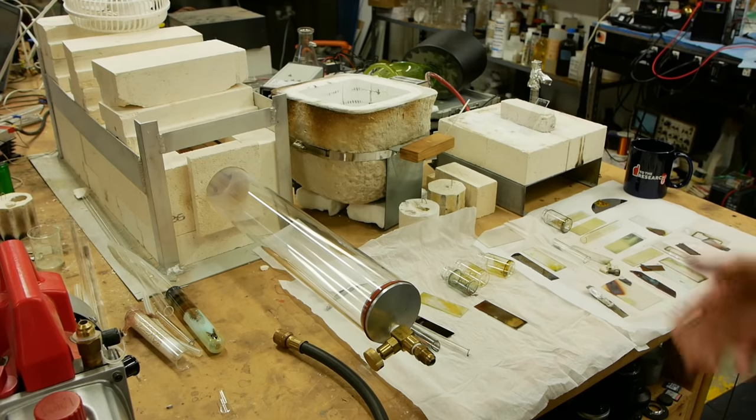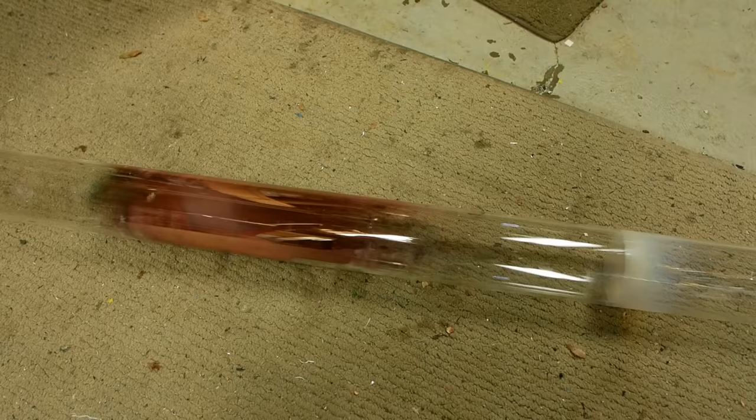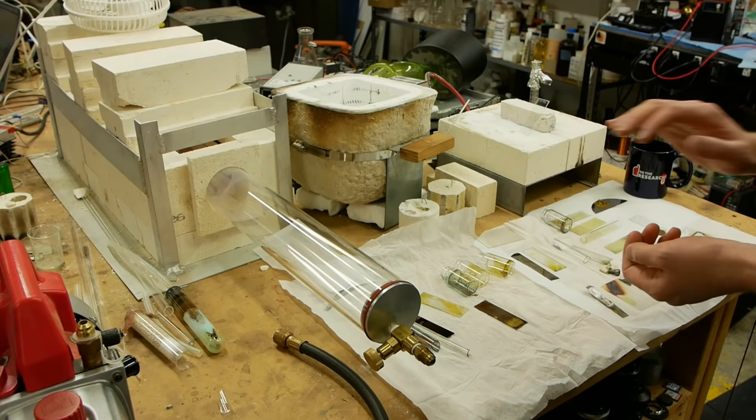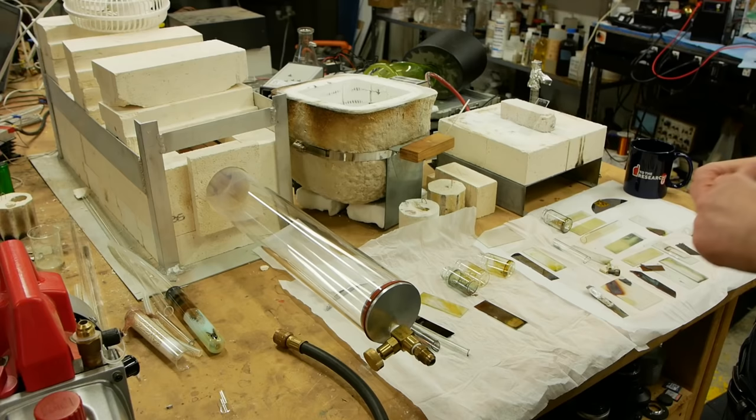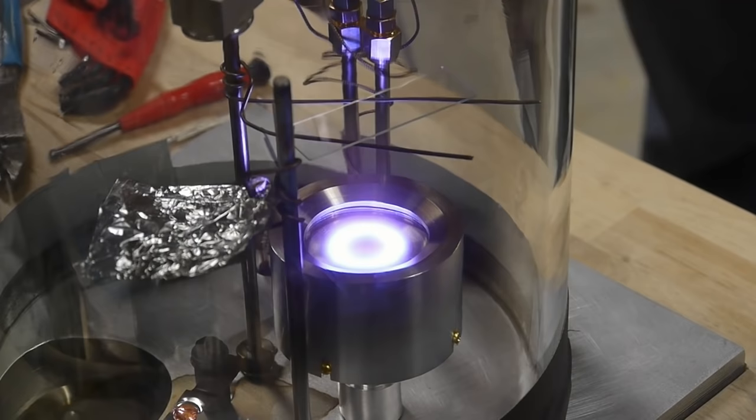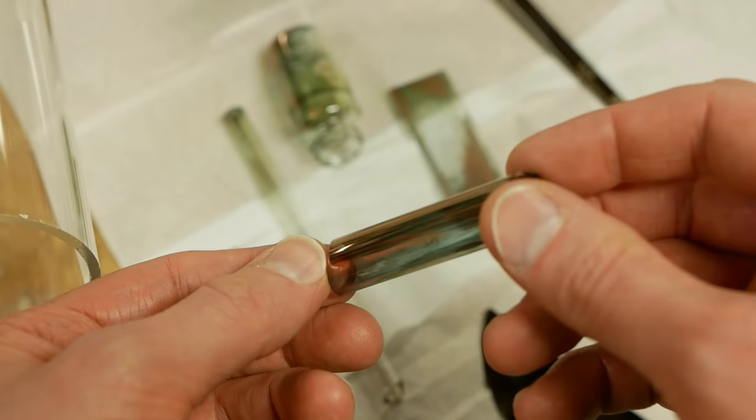Today on Applied Science, I'd like to tell you about a technique called atomic layer deposition. This is a really cool technique to build up a layer on something like a microscope slide or piece of glass, atom by atom. We control this by switching between two different gas chemicals that we flow across the substrate. So you may have heard of other techniques like sputtering or physical vapor deposition. This is another one in that bag of tricks of making a coating on something. But atomic layer deposition has a lot of cool features and some drawbacks as we'll see.